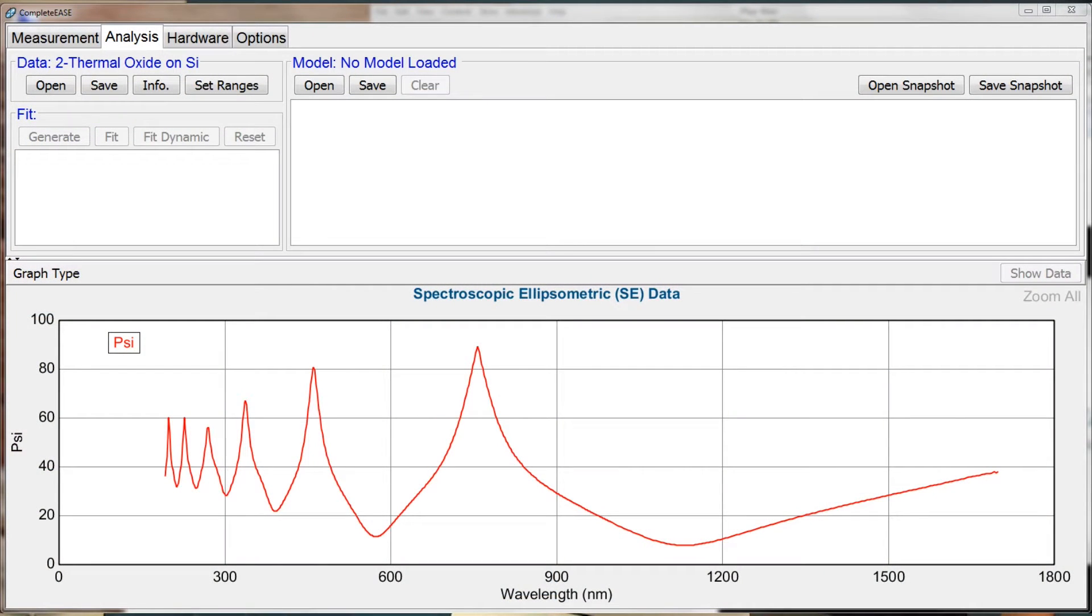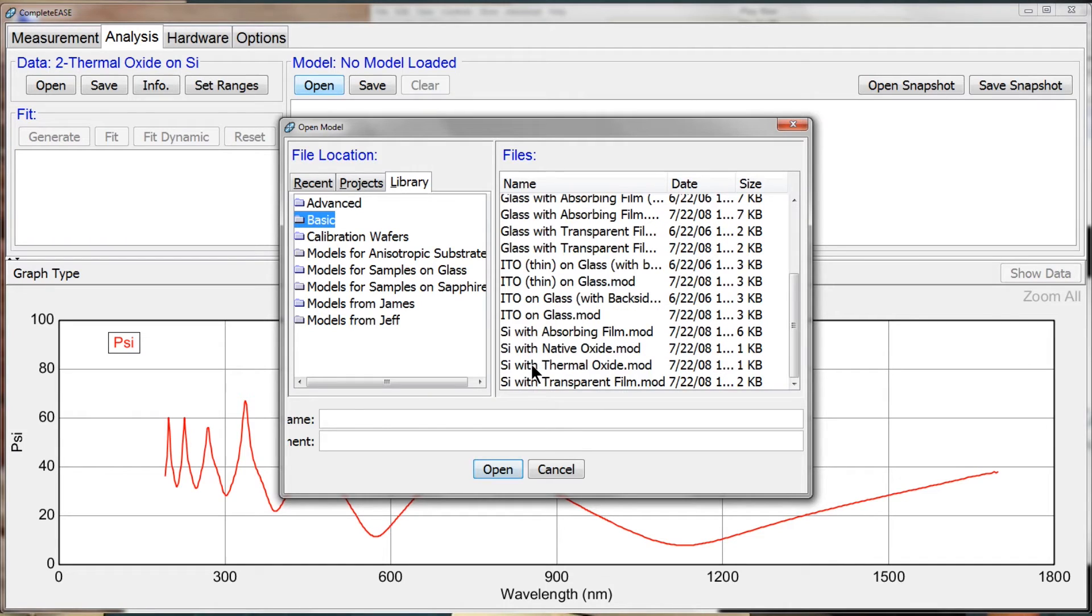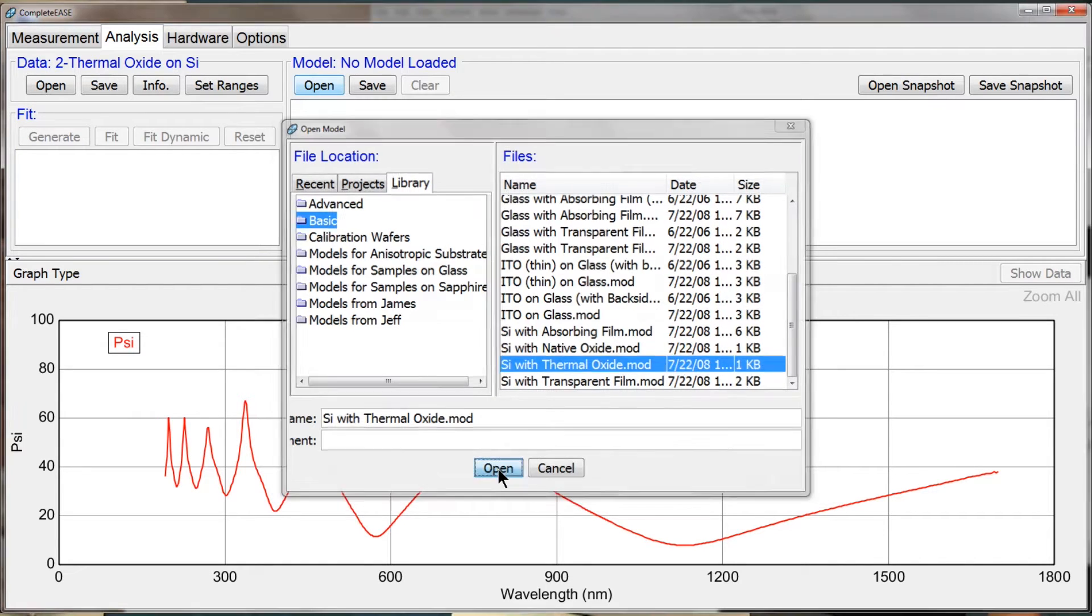Let's jump over to that data in CompleteEase. This was a measurement on another thermal oxide on silicon, so I'm going to open the same model we used in the previous section, which is the silicon with thermal oxide model.